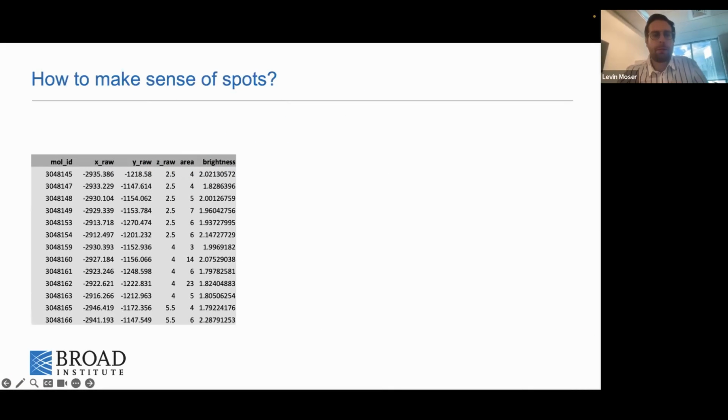So what are we going to do today? Think about that. Someone in your lab, or a friend, made an experiment using some sort of spatial transcriptomics platform, and what was generated as output was a table like this, a table with literally millions and millions of rows filled with some numbers. And now the question is, okay, what do we do with that, right?